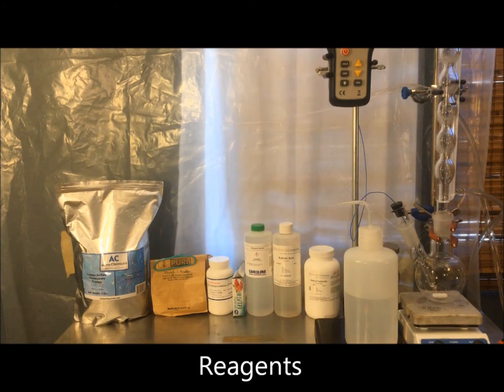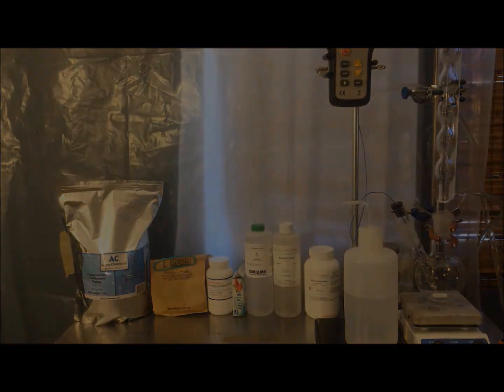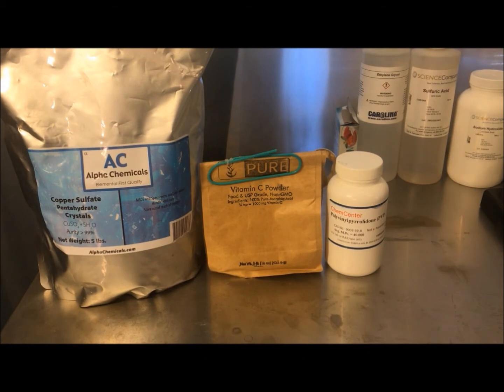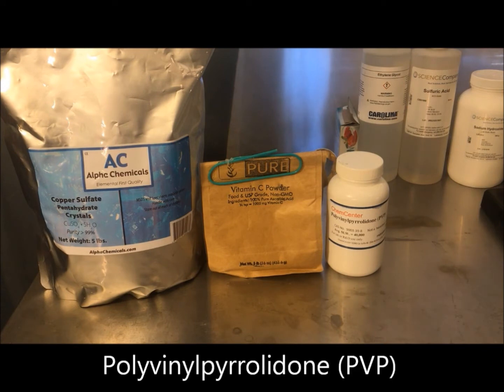So there's several wet chemistry methods for synthesizing the nanoparticles. All of them involve reduction of copper salt in the presence of a capping agent to control size and dispersion. Today I'm going to be doing the same reaction I did in the first video, which is the reduction of copper sulfate by ascorbic acid. The capping agent is povidone, which is a binder used in the pharmaceutical industry to make pills, for instance.